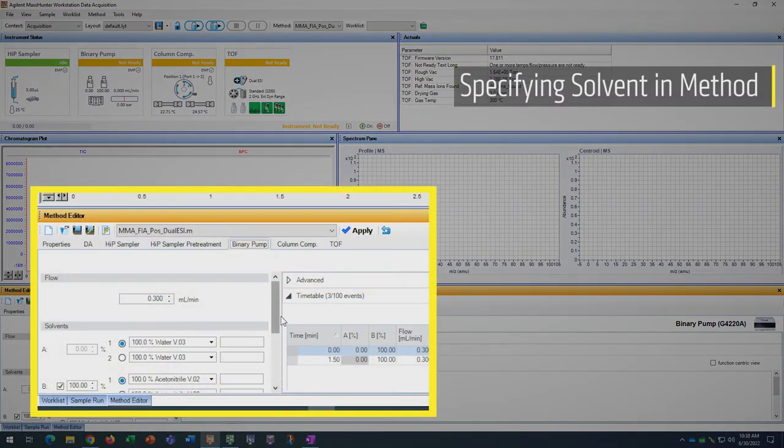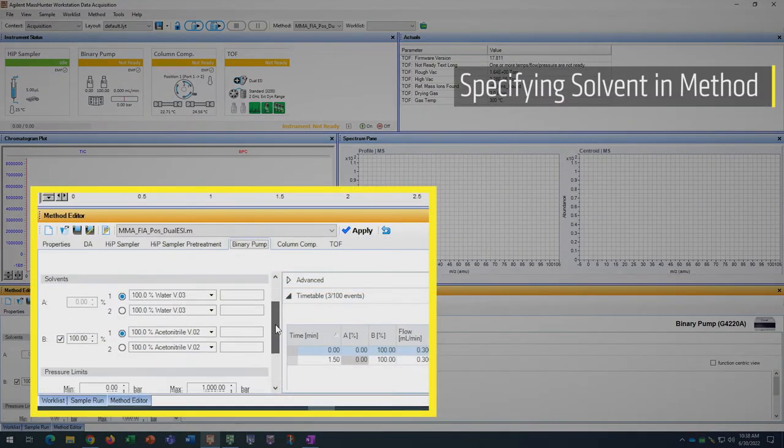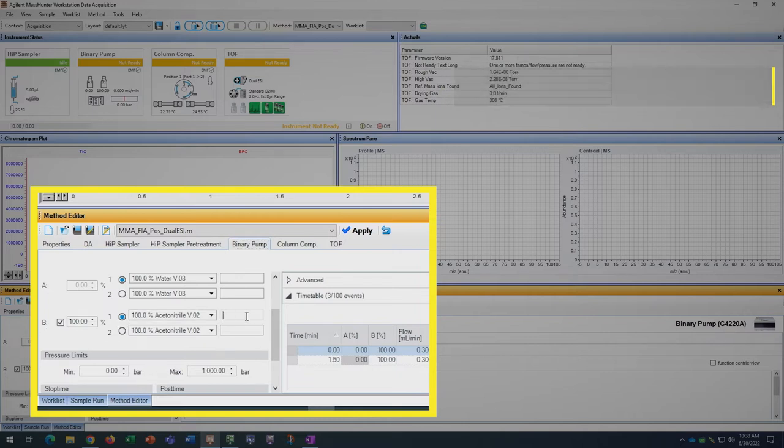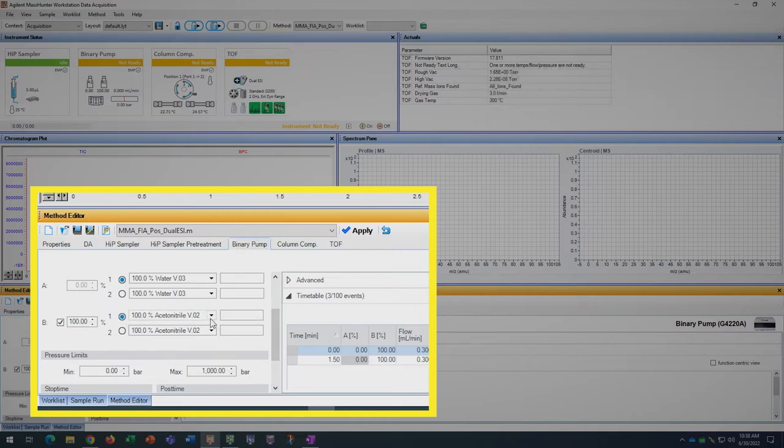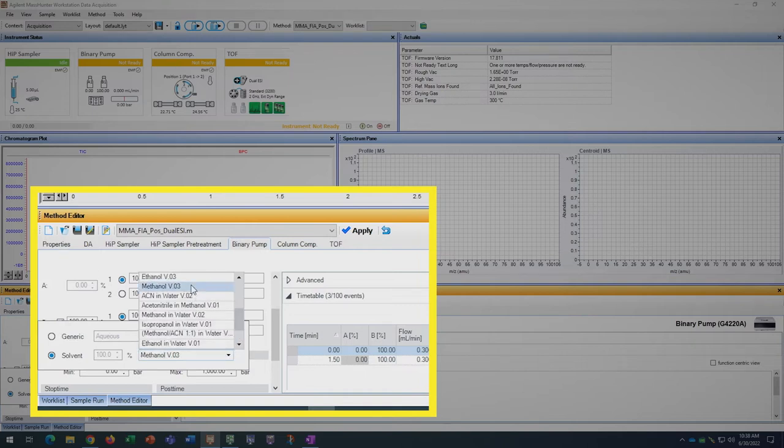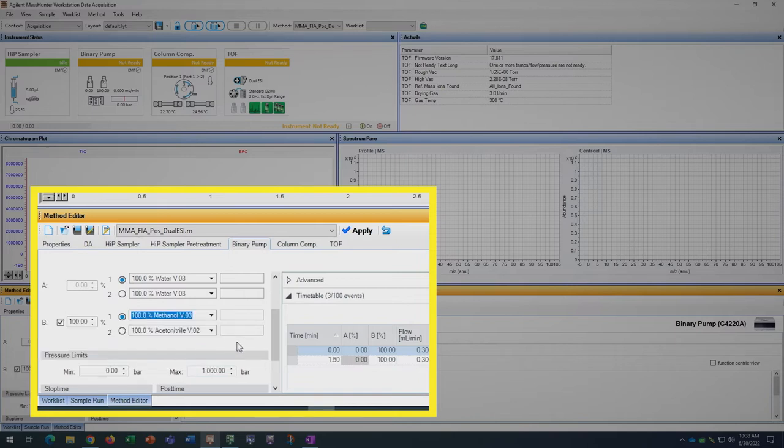In the binary pump tab, check that the solvent bottle you need is set to 100% for the duration of the method. 100% methanol on the B1 channel is what we will need for today. If you have made any changes to the method for your solvent, click apply and then save method.